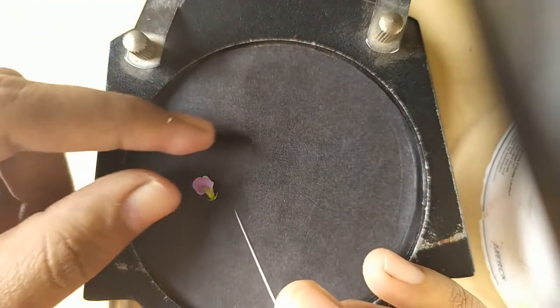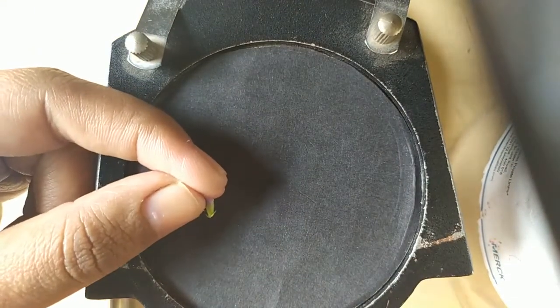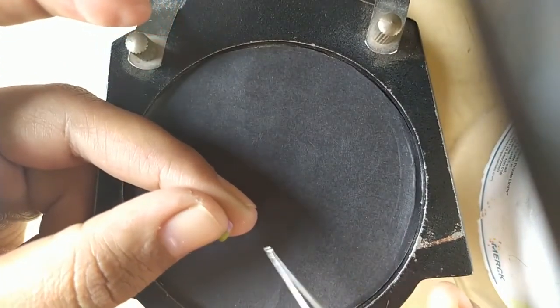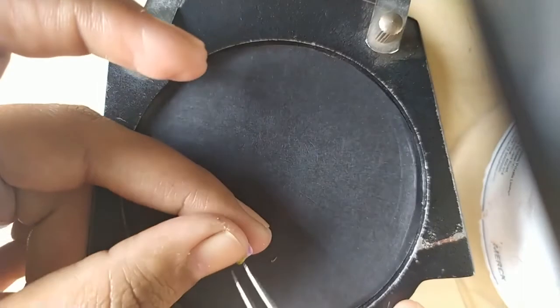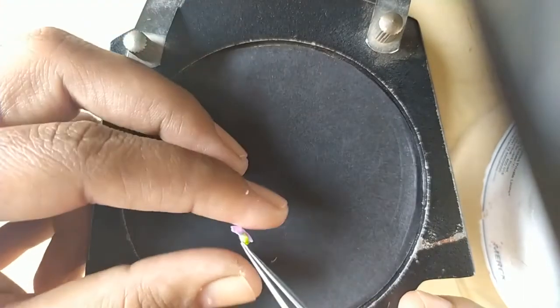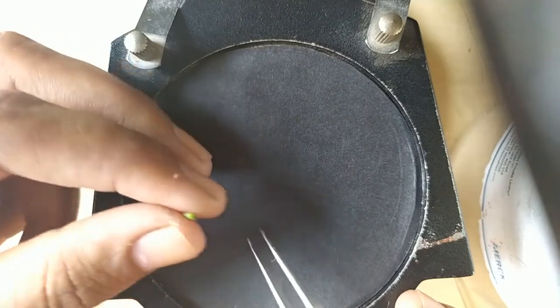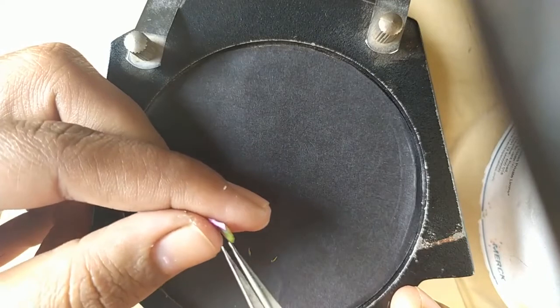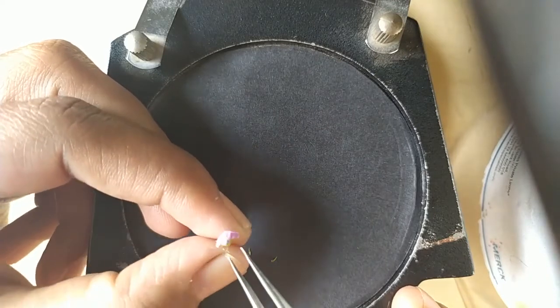Here firstly you have to remove the bracts. The two bracts are present on the calyx opposite to each other.